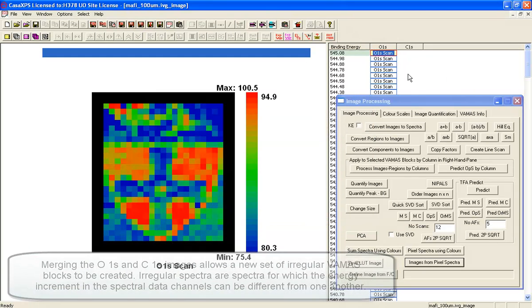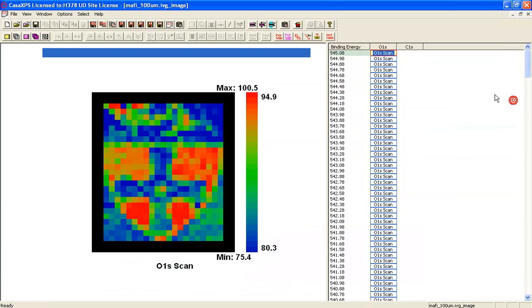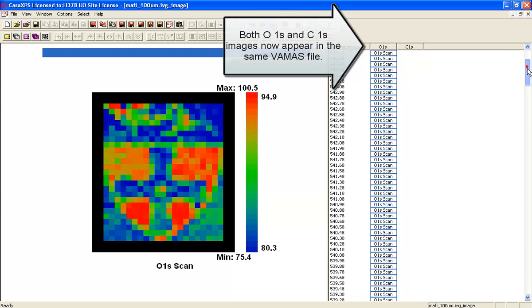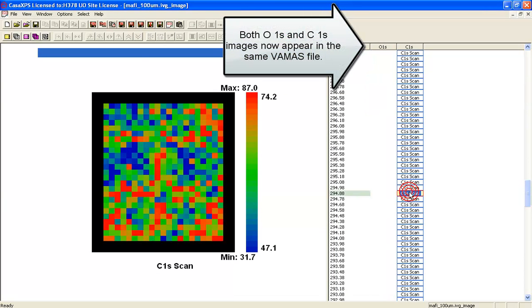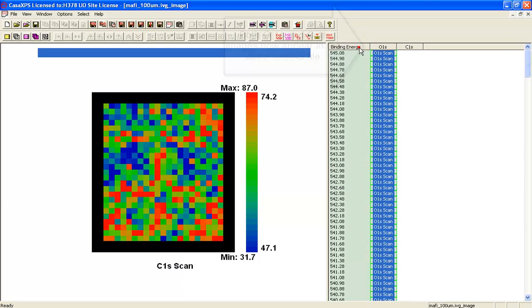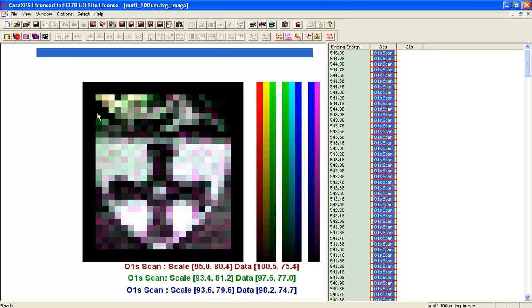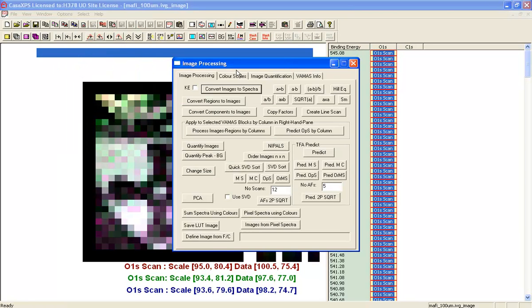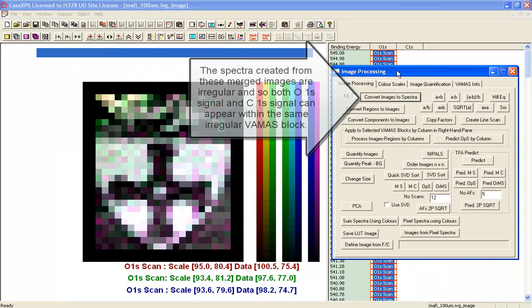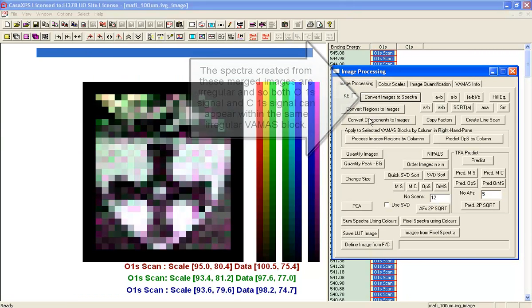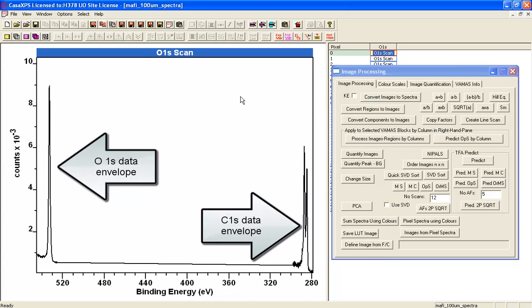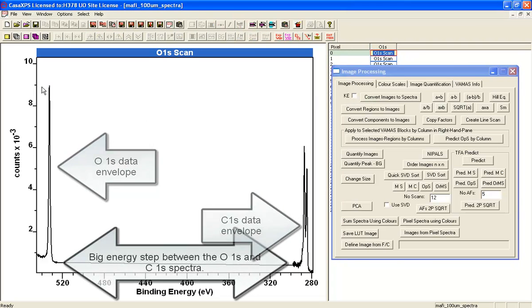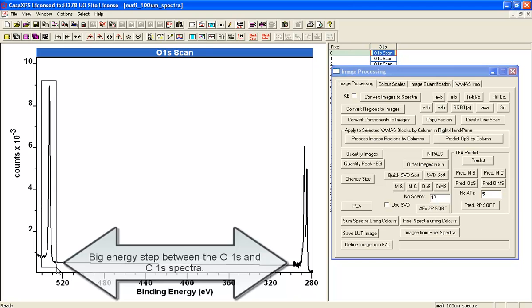Now I have both oxygen images and the carbon images. This means that when I overlay and use the option that says convert images to spectra, I've overlaid the oxygen and the carbon one together. So when I create them, I get spectra that are now a combination of both.